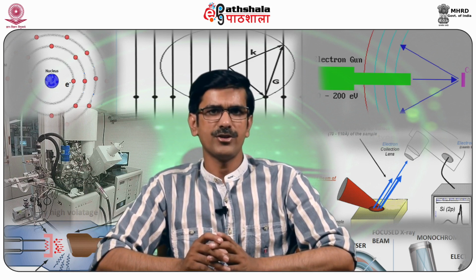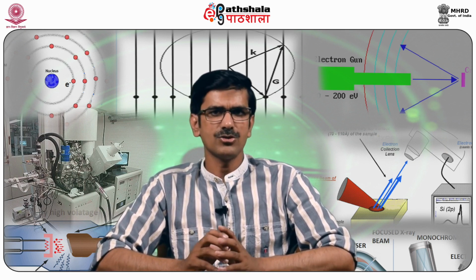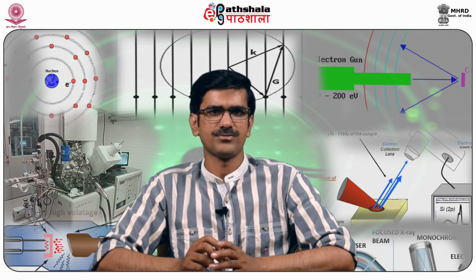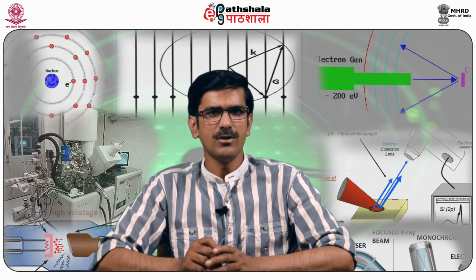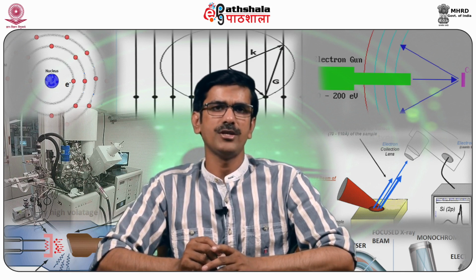While many components of the instrument used in PES are common to both UPS and XPS, the radiation source is one area of distinct differentiation. The radiation source of UPS is a gas discharge lamp, with the typical one being a helium discharge lamp operating at 58.4 nanometers, which corresponds to 21.2 electron volts of energy.